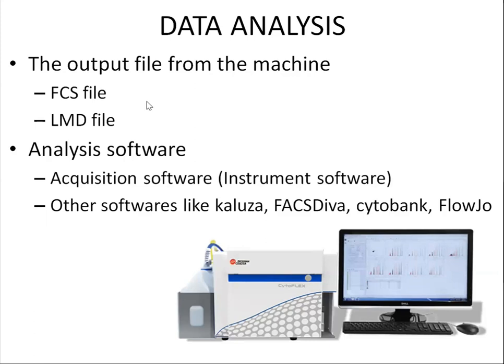The other format of that particular flow cytometry file is called list mode data file. Some instruments give the output in this format, and many other instruments give data output in the flow cytometry standard file format. So this is just an output from the machine.